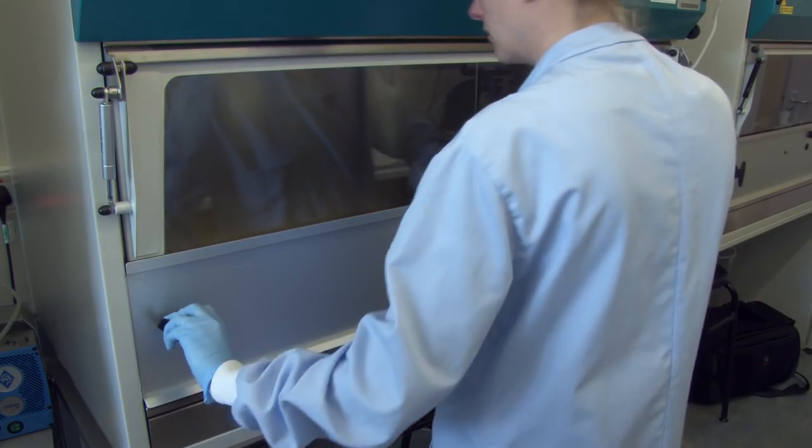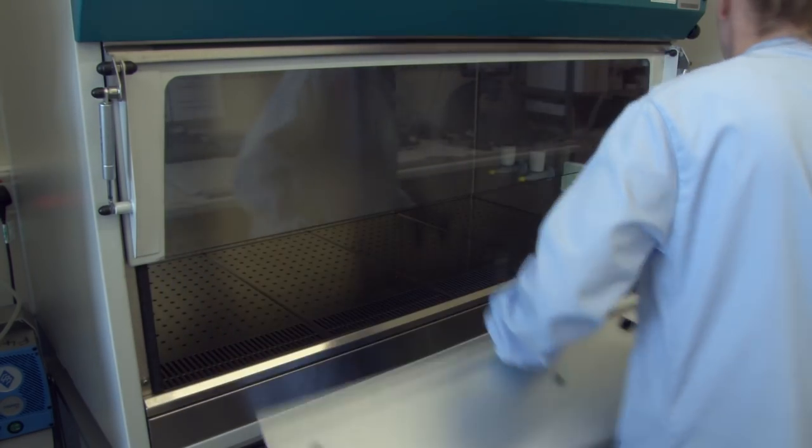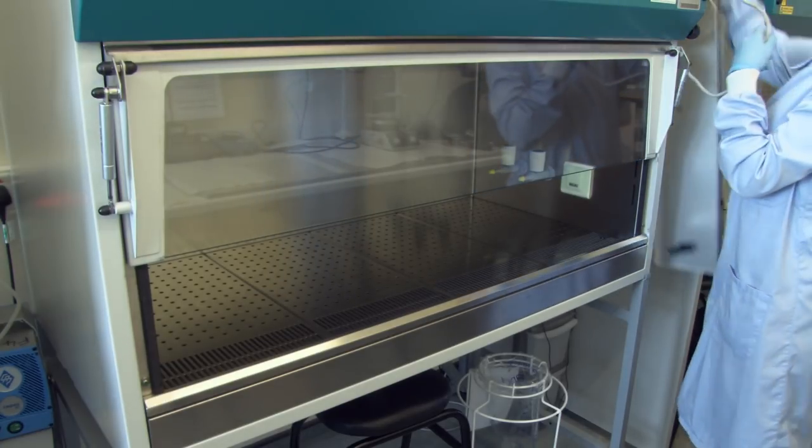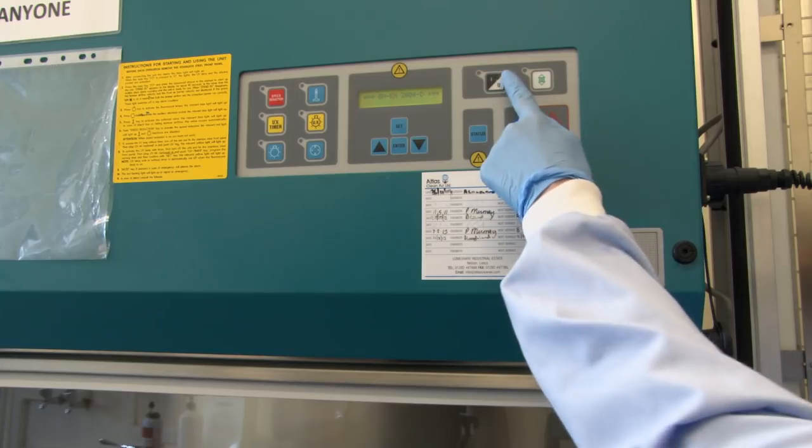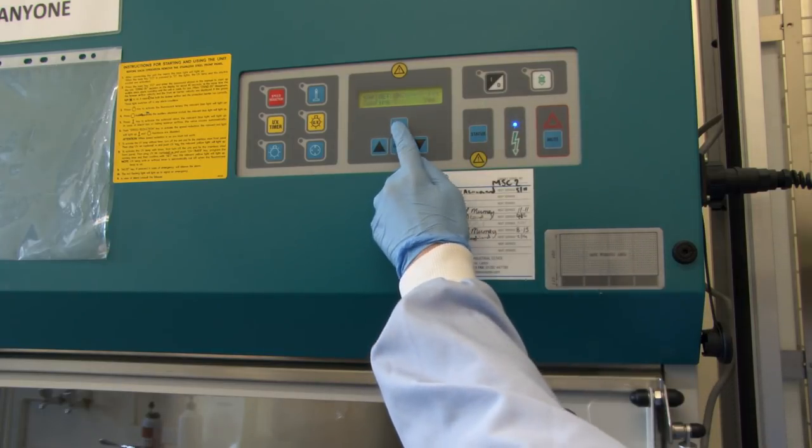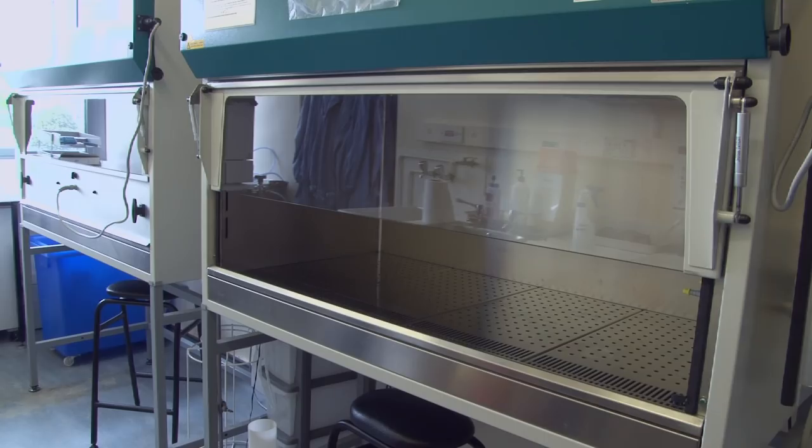This is a class 2 microbiological safety cabinet. Air from outside the laboratory is drawn through the front and underneath the plates at the bottom. It goes up a space in the back and is pushed down through the top through a big filter which removes dust and microorganisms so that the air which flows down to the working space is relatively clean.